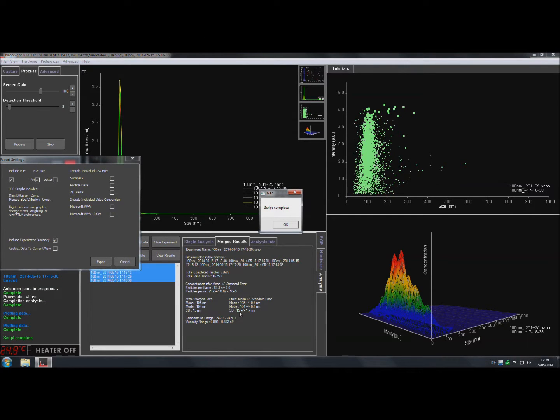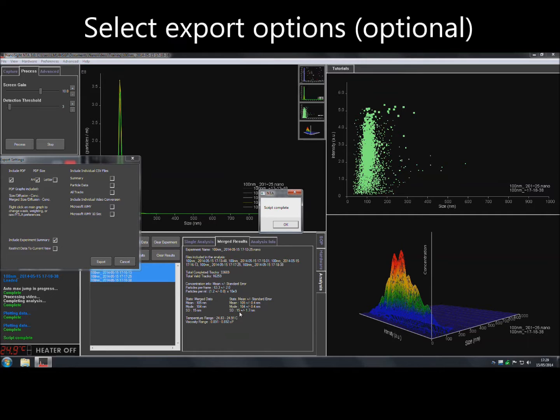Once processing is complete, select any required files and then click Export.